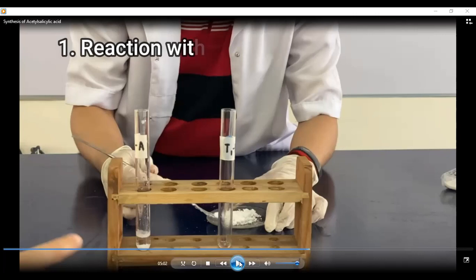By the way, the test tube on the left is the theoretical aspirin, the lab available aspirin. The one on the right is the synthesized aspirin from earlier.